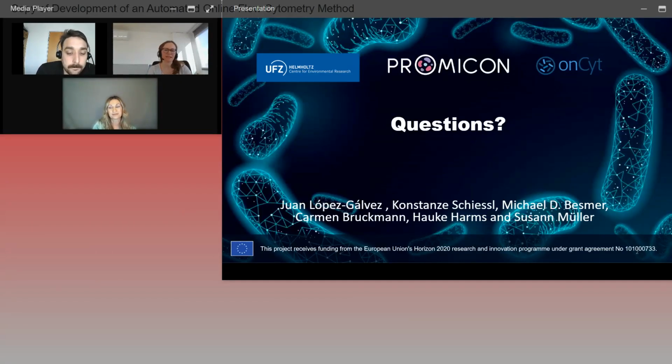So I guess this is then going into once you have an online system running and you might change the way you run, for example, your bioreactor process. So I guess the change would have to be significant enough. I don't really know what community composition noise would be.